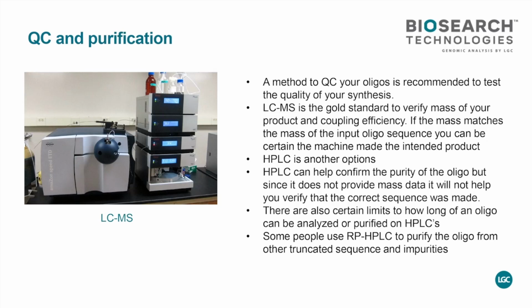The old Combicep instrument used to take the plate, goes in with 96 probes, pulls everything out, and runs it in parallel. So in 1 hour, you will have a profile of your oligo and see how clean it is. HPLC doesn't do that. HPLC does one oligo at a time. So if you have a small throughput, like 4 to 6 to 12 oligos, HPLC is a good option. If you're going for the plate analysis, I would recommend you look into getting a Combicep.